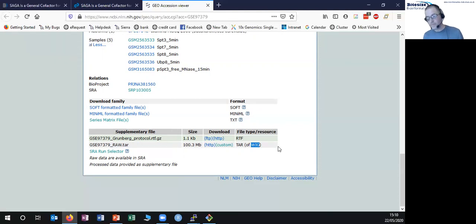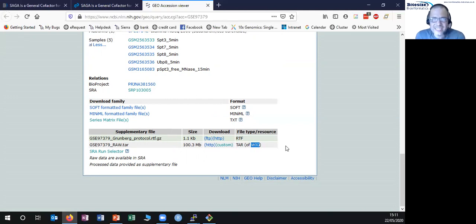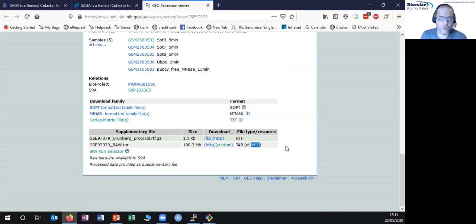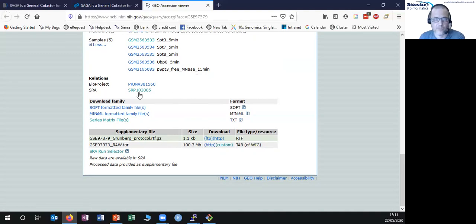If you want to go back to the original data and process it in a way you control to get the quantitations you want, the supplementary files aren't going to be the way to go. We want to go one level further back and look at the actual raw sequence data that was deposited, because from that we can reprocess and do whatever we like. GEO itself doesn't hold sequence data — GEO is a repository for metadata and for the quantitations people have submitted. For the actual raw sequence data, you need to go to a different linked repository: the Short Read Archive. Somewhere on the GEO page there will be a link to the corresponding Short Read Archive entry, and that's where the actual sequence data lives.